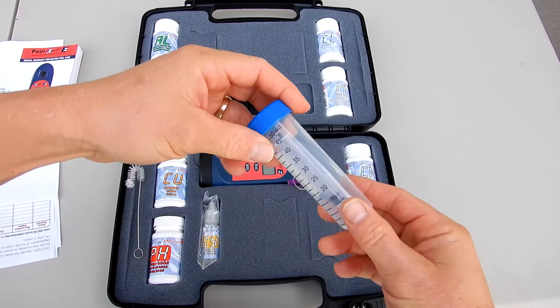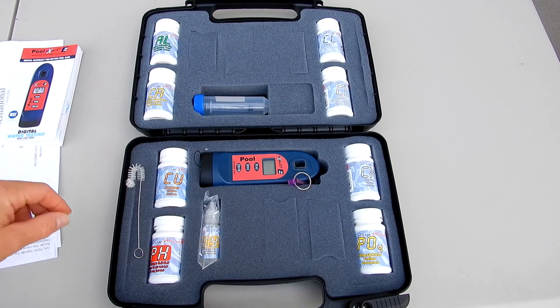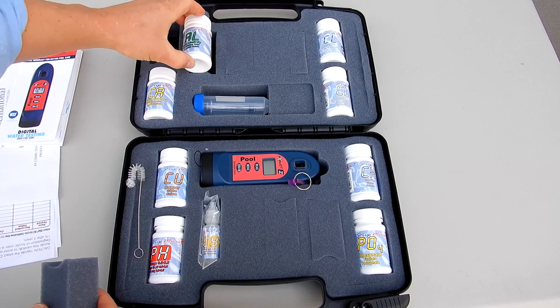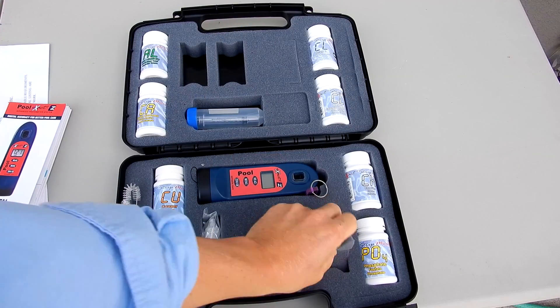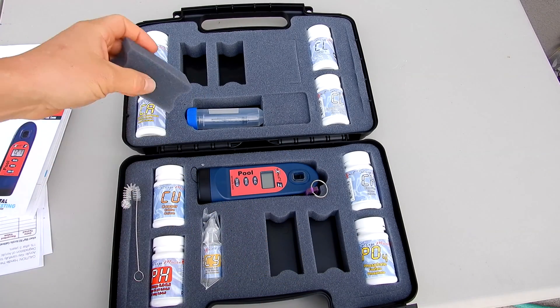There's also a test tube and a syringe included. What I really like about this kit is that there are spaces where you can actually add more of these EXACT Micro strips. This will allow you to carry more of the strips back to your service accounts for testing.